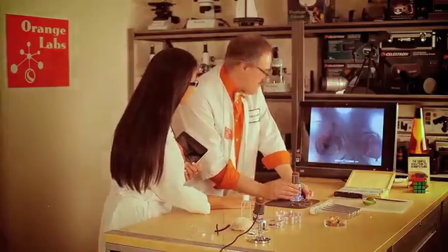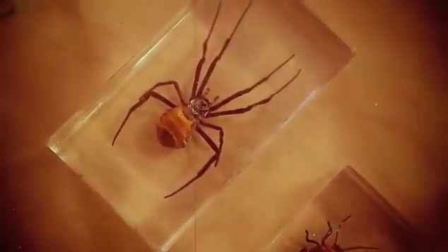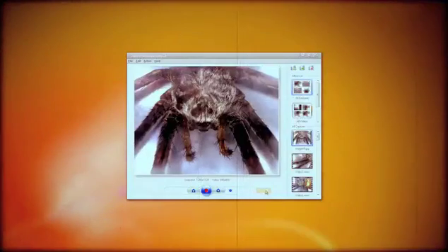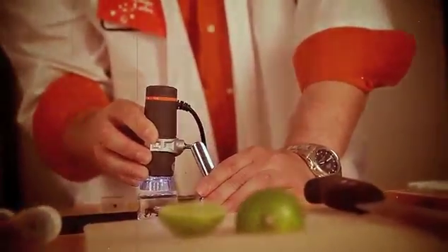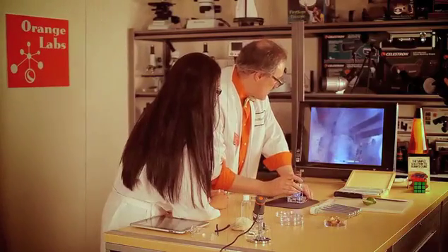With that I can view things of all kinds of different scales. Pretty amazing, huh? This is really fun. I bet I could look at some other fun stuff too. Why don't we look to see if we can find some things? Wow, he's even bigger. Look at this. With the nifty measuring software that comes with this microscope, I can even do little measurements. Let's see how far his eyes are apart. That's amazing. Look at the size of those legs. You can see all the hairs and tendrils. Let's see how easy it is to take a picture. All I have to do is press this big orange button. Just like that. And now we have a picture. And it saves it right onto your hard drive.